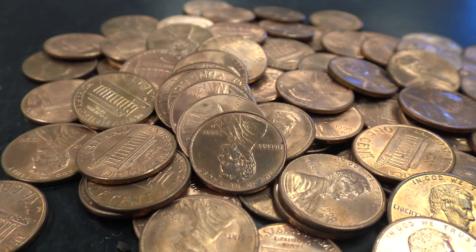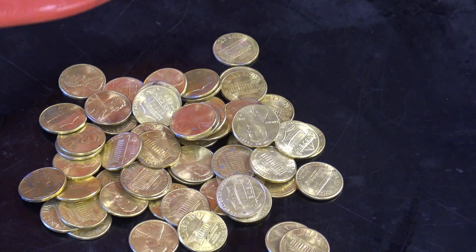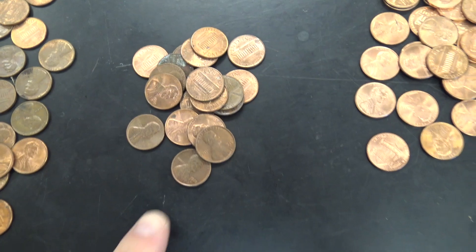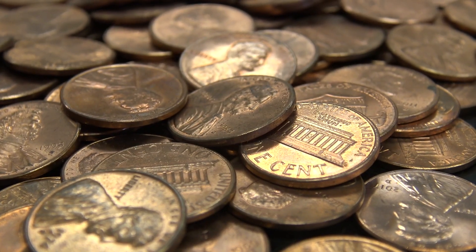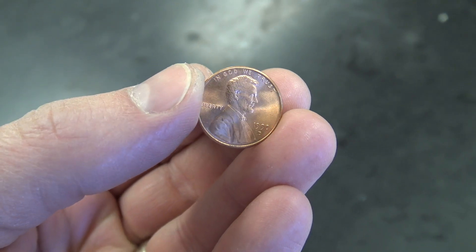I'm going to show you how to take a regular old penny and turn it into a silver penny, and then eventually into a gold penny. That's pretty awesome, right? This is a really good excuse to go dig out those old pennies and sort through them. Try to find the nicer ones — they're going to look a little better as a gold penny than the roughed up ones. Get yourself a nice big pile and let's turn these things into gold.